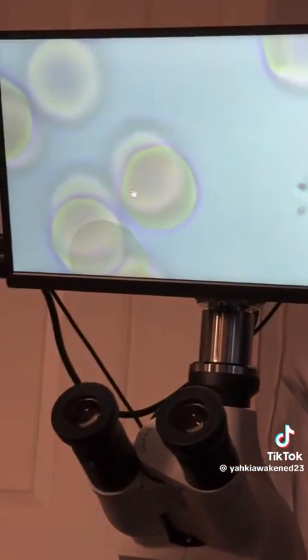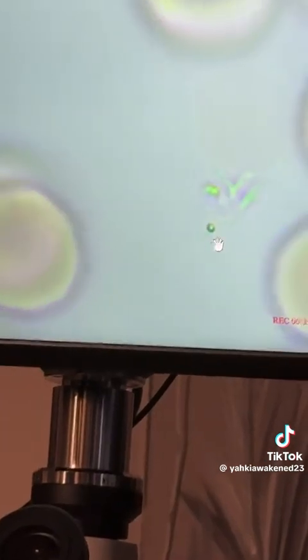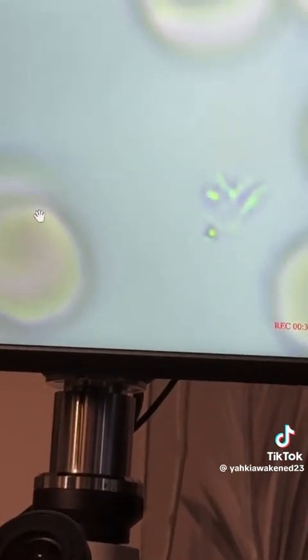All right, here go some deposits right here. This is what you would call a yeast deposit. Yeast candida deposit. Y'all see that? So that's yeast and candida. I can see a few chemicals here. Looks like some ibuprofen or something like that in the blood.